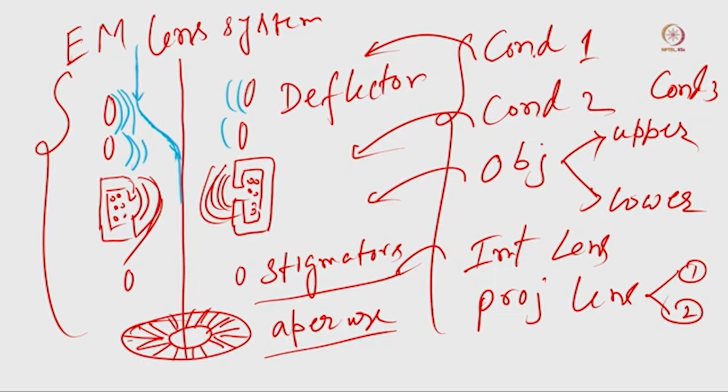That is the reason we always use the deflector during our microscope alignment, and it is very important that when the electron beam or light source comes, it always follows the optical axis, and this is our optical axis. So this is the role of the deflector. Then the stigmator also helps to arrange the beam so that it follows this optical axis and follows a circular way. All the beam should come as parallel. The stigmator is dealing with these things.